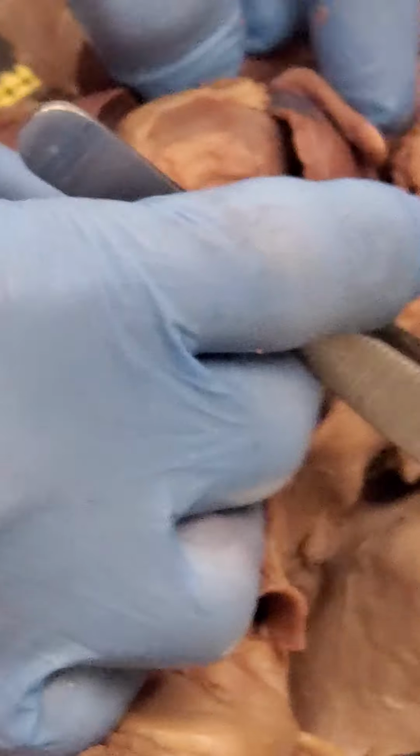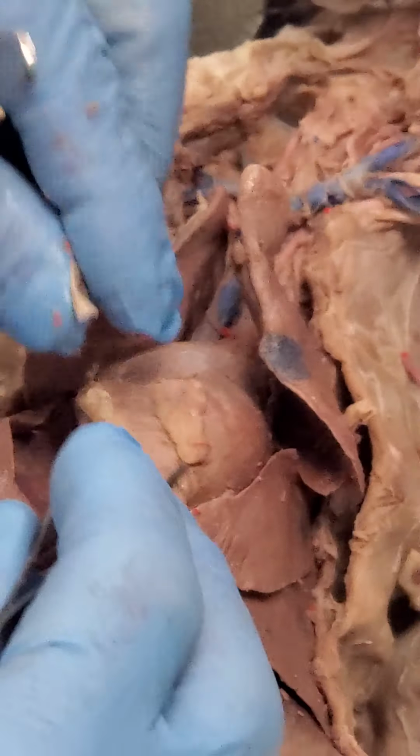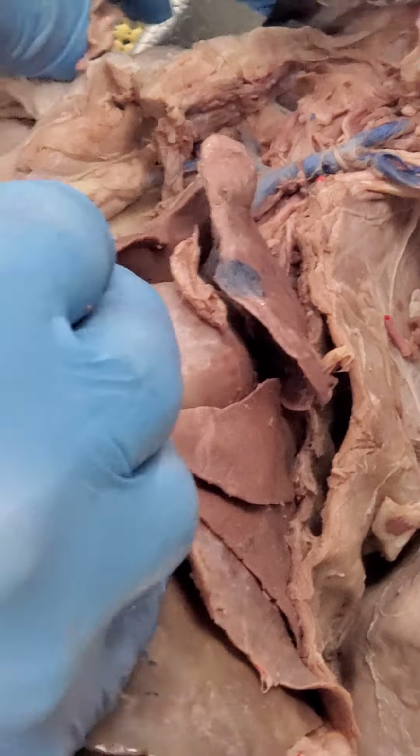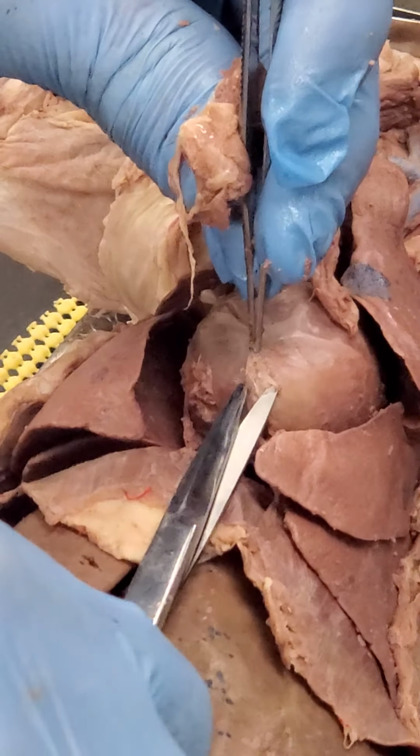Can you do the upper ones again one more time? Sorry. Let's see. Here's the heart, lungs. You couldn't see this for those that weren't here. Parietal pericardium. I was talking about it in the lecture today. That's this. See this bag-like thing here? That isn't on the cow hearts because it gets cut off when you remove the heart from the carcass.